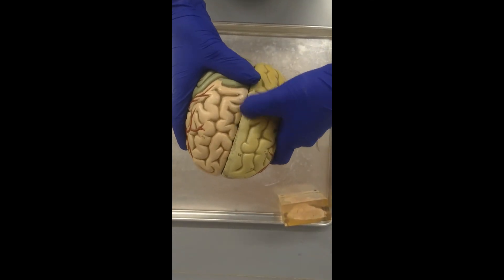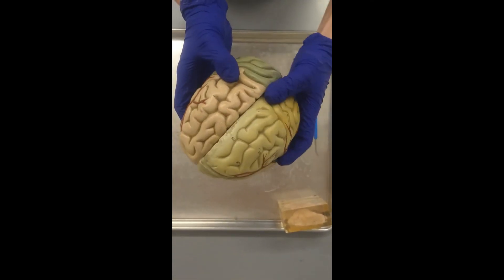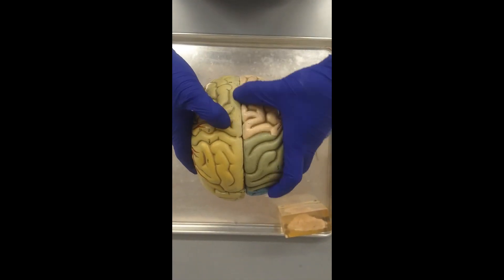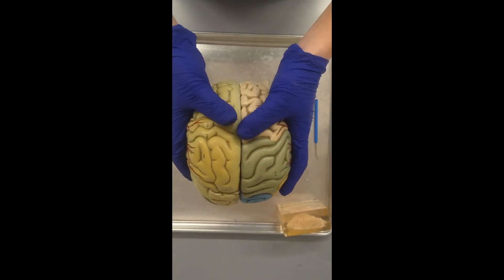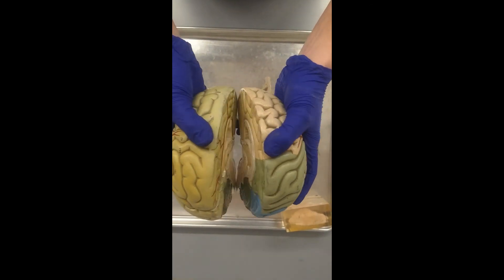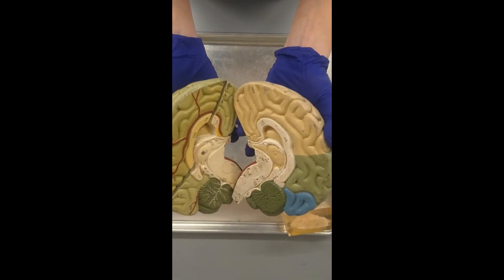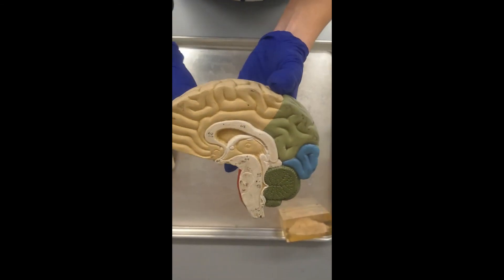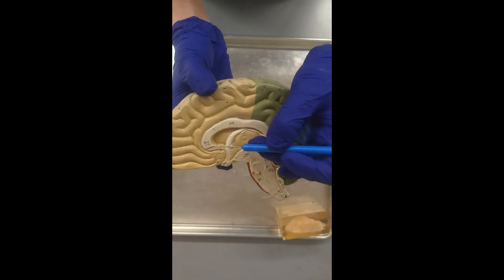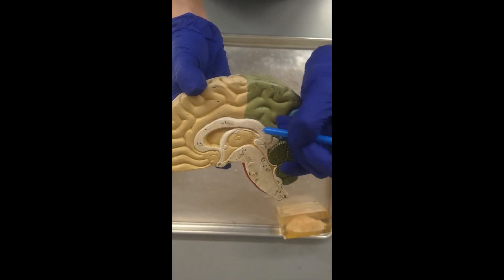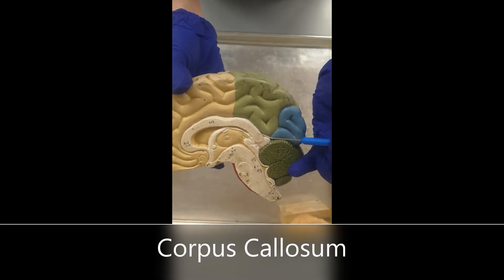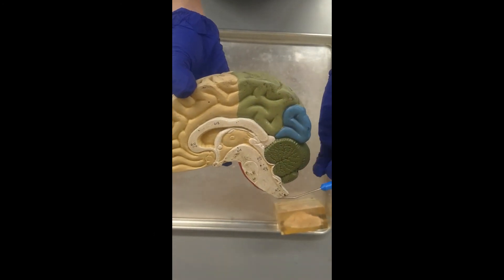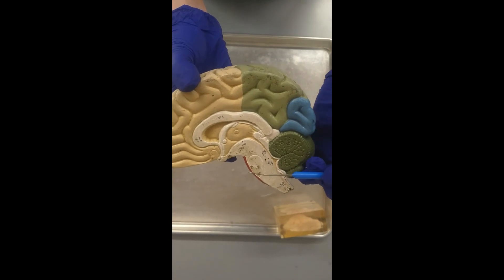We're going to split this along the longitudinal fissure and go over some internal structures. The first thing I want you to look at is the corpus callosum. This is really cool — this is how the right and left hemispheres of the cerebrum communicate with each other. We'll cut this open in the sheep brain as well. White is going to be myelinated axons, and you'll see gray in there too for the neuronal cell bodies.